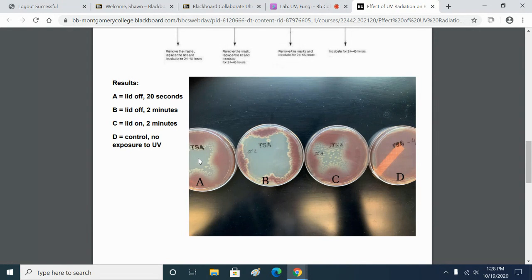Now, I see something interesting on plate C. If you look in the kill zone, you see colonies growing. So there were some bacteria that survived the treatment. But what color are they? White? Well, they're actually sort of non-pigmented, right? But they're not red. They're still Serratia marcescens, but they're not red.